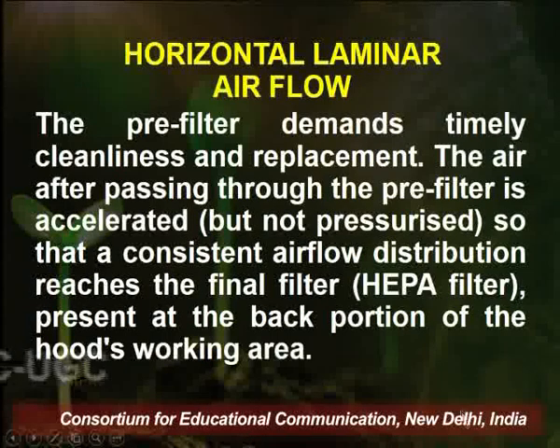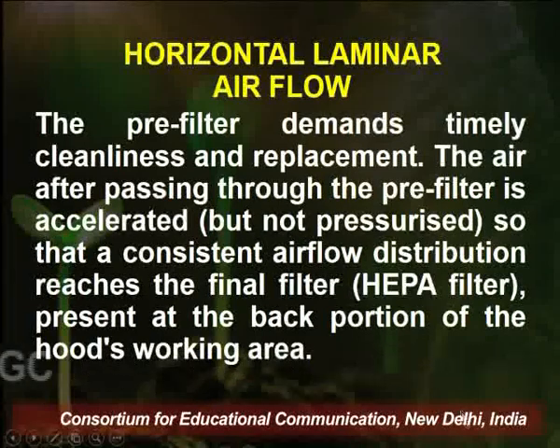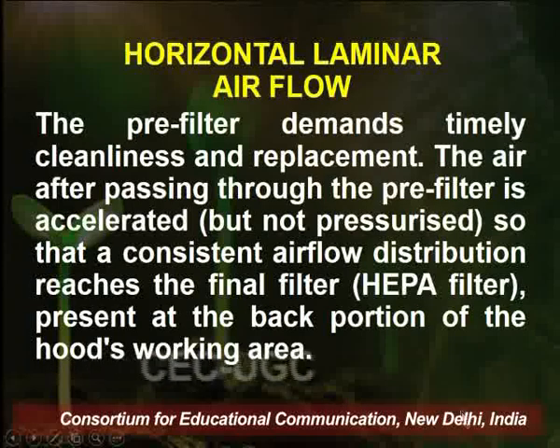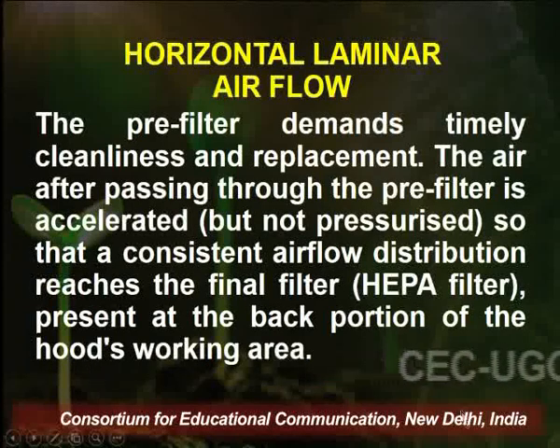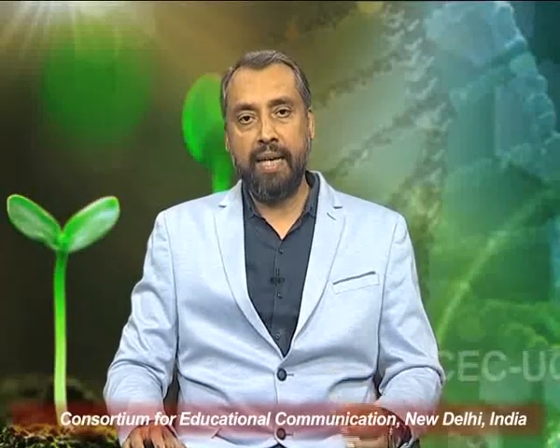The air after passing through the pre-filter is accelerated, but not pressurized, so that a consistent airflow distribution reaches the final filter, that is our HEPA filter, which is present at the back portion of the hood's working area. The HEPA filter removes 99.97% of 0.3 micron or larger sized particles, thus removing most of the 0.5 micron or larger sized airborne microorganisms.